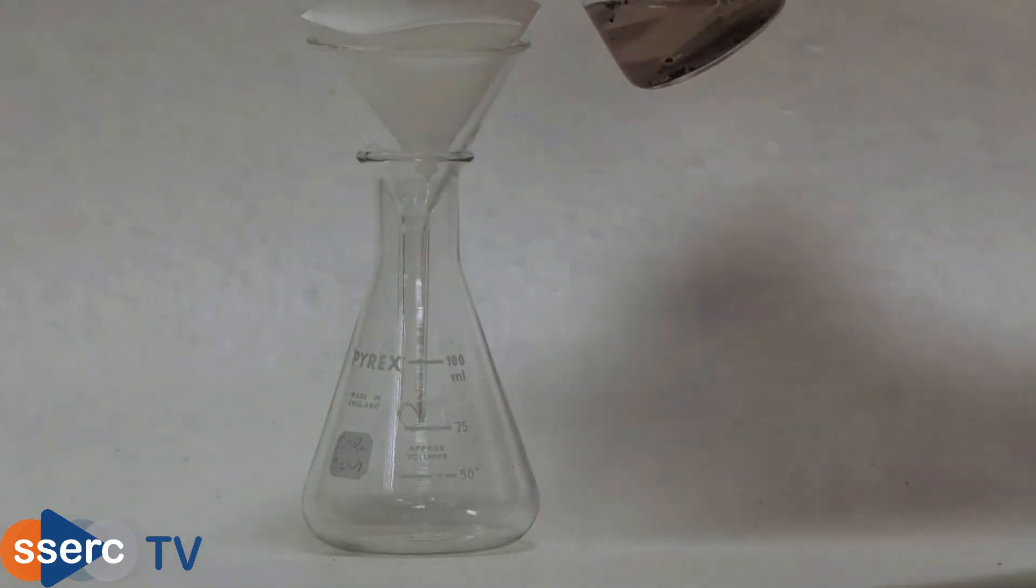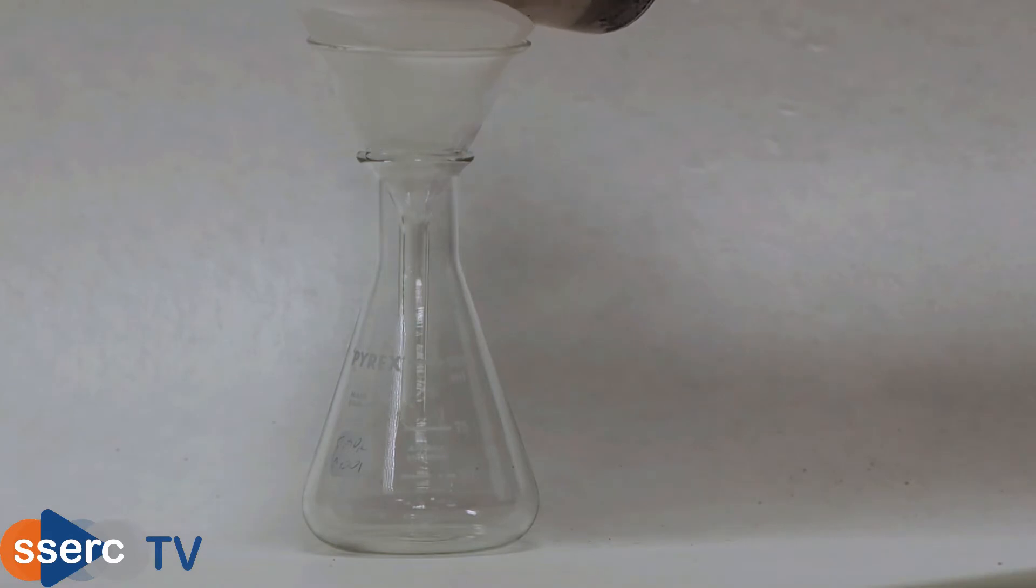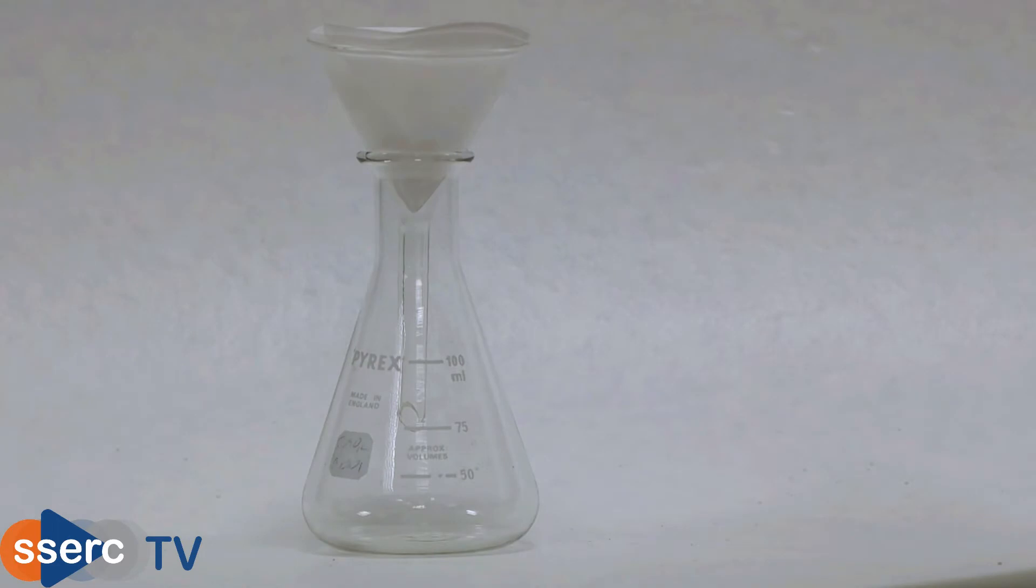Once you've done that, filter the nitric acid into a clean flask to remove the insoluble residues. The iron is now in the form of iron three nitrate solution.